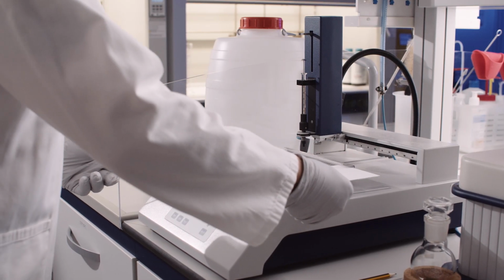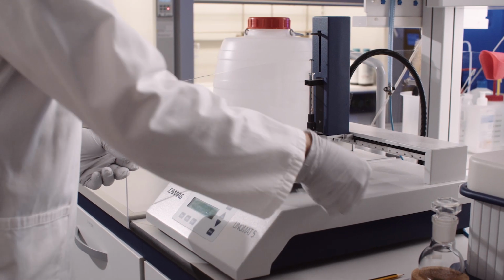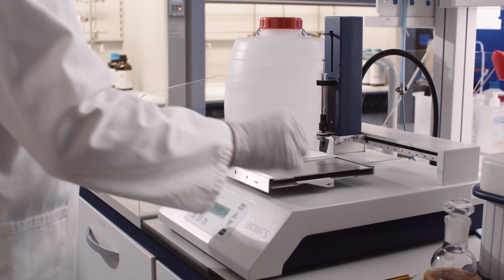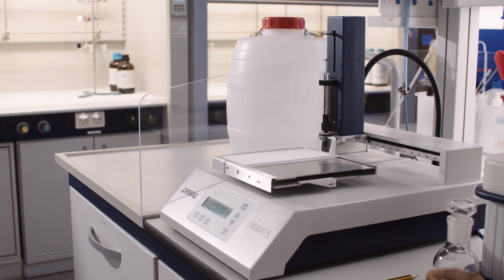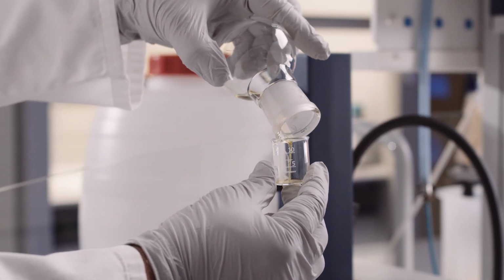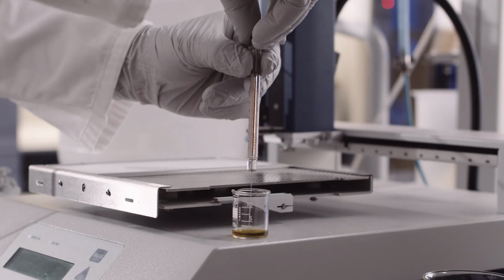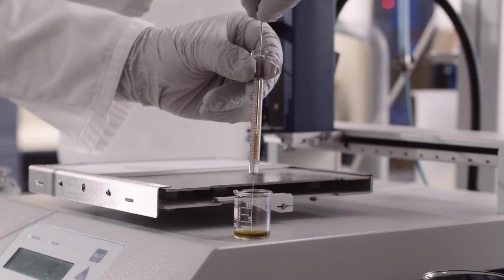The alkaloids are detected using thin-layer chromatography, also referred to as TLC. More modern chromatographic methods, such as high-performance liquid chromatography or HPLC, could also be used, but thin-layer chromatography is a good choice due to its quick and easy execution and the presentation of results.